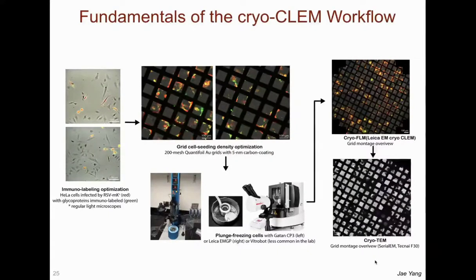As you've seen, we have a robust workflow for Cryo-CLEM studies of virus-infected cells. This workflow relies on tools from Alvéole, the PRIMO system, and Leica, namely the EMGP and the EM Cryo-CLEM. With these tools in hand, we are developing improved routines for better automation and correlation between the cryofluorescence microscope and the cryo-EM data.